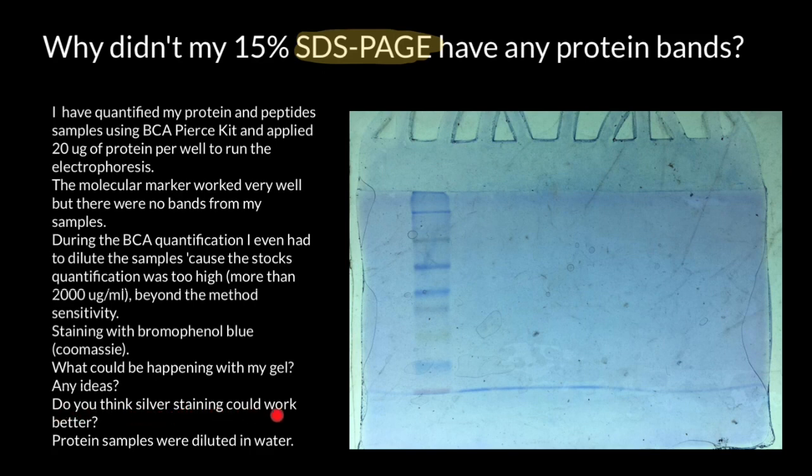Do you think that silver staining could work better? The protein samples were diluted in water. I found the answer in the question itself. Bromophenol blue and Coomassie are not the same stain — they are two completely different stains which serve two completely different purposes. This researcher mistook them, thinking they were just different names for the same stain, but that is not so.